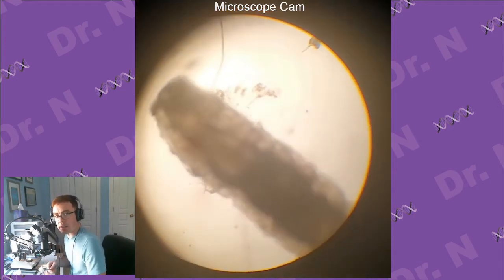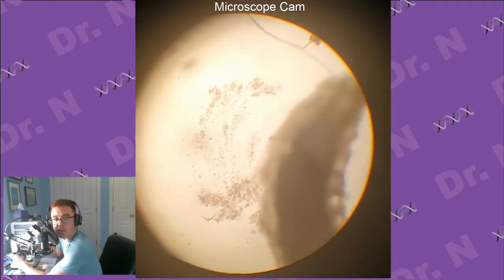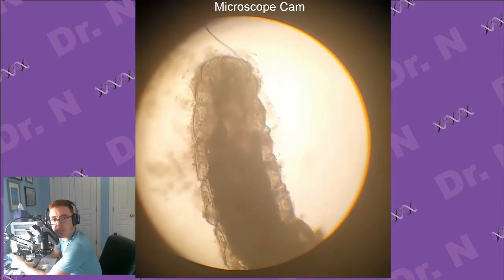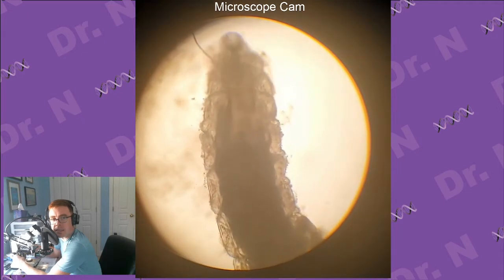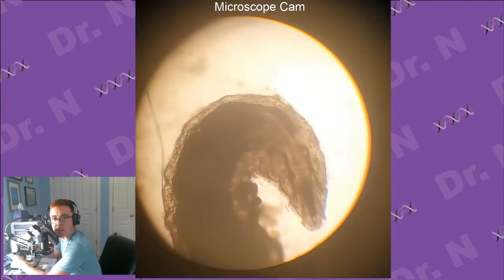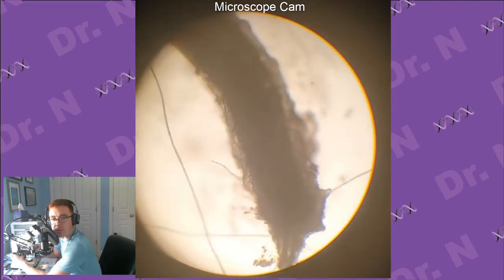So the part we're looking at right now is its mouth hooks near its head. Let's just watch it. That's some of the food that was stuck to it. Let's zoom out a little bit. Yeah, you actually see pretty well into it. So there are dark sacs on either side of its head that's bobbing in and out. When it extends, you can kind of see them. Those, I think, are the salivary glands when they're inside the larva. It's pretty dirty. Oh, you can see some tracheal tubes, so that's how it gets air.